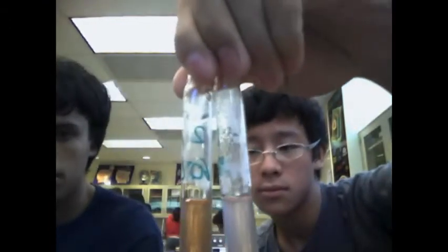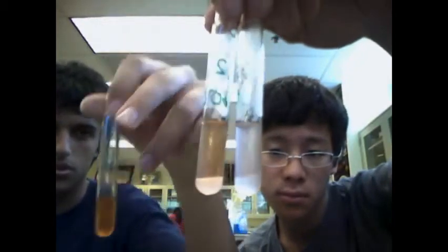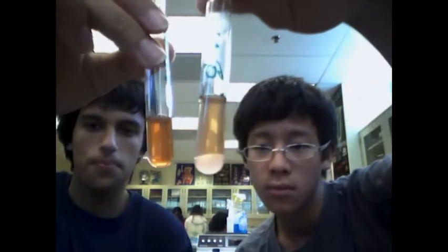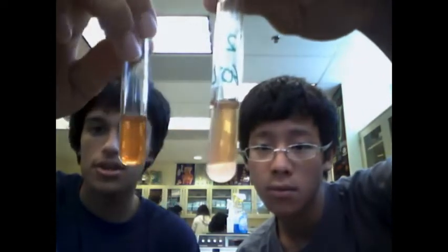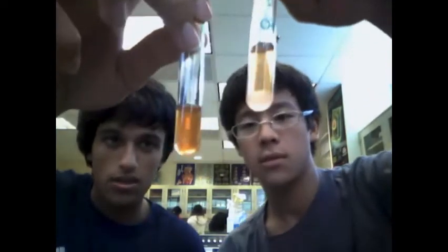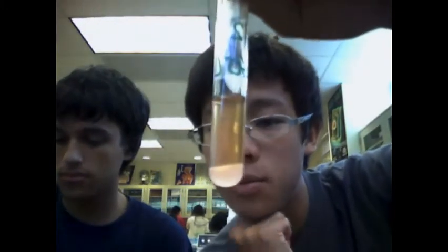Here, we compare the positive control with test tube number 2. This is lighter, showing that this had less of a reaction. And you notice there's precipitate at the bottom of the test tube.